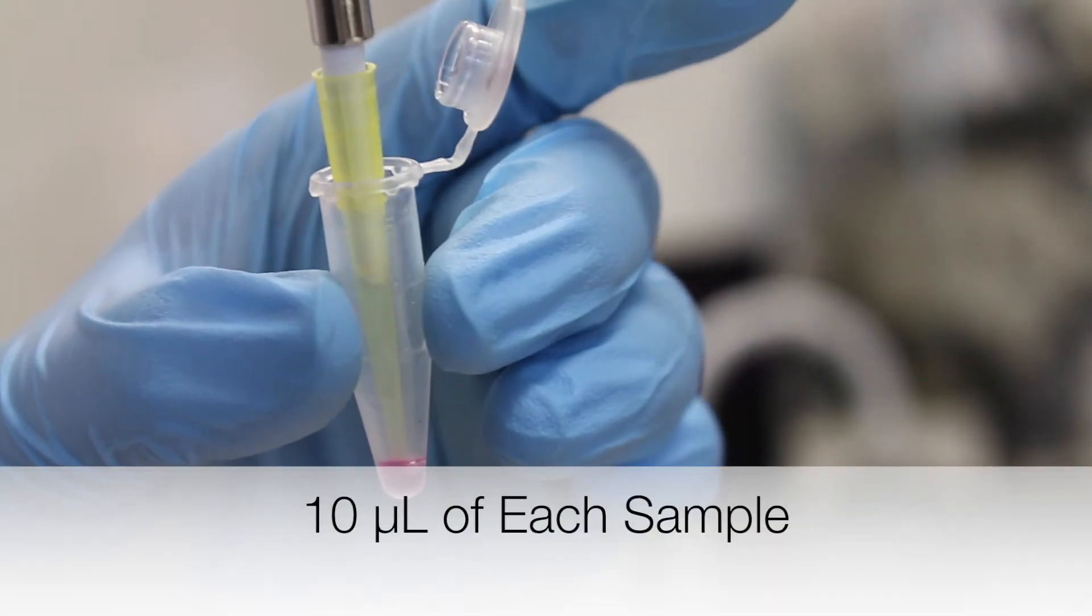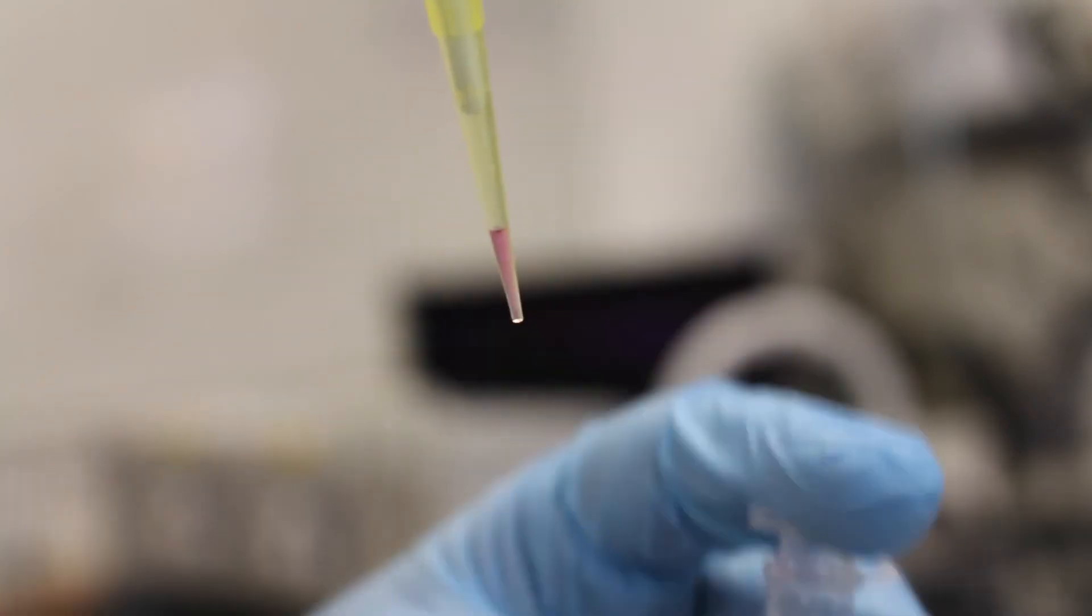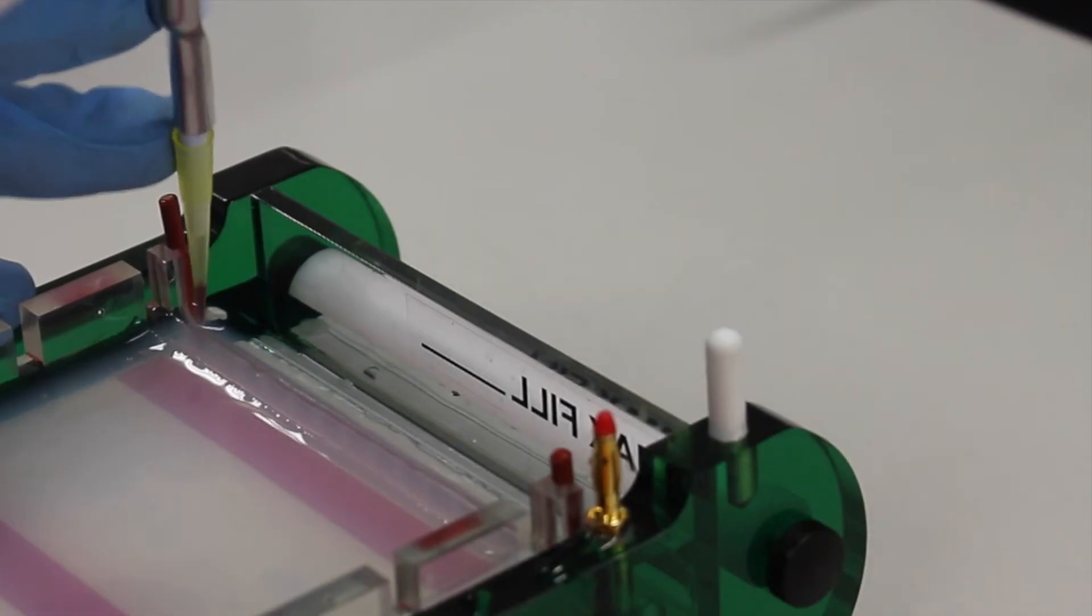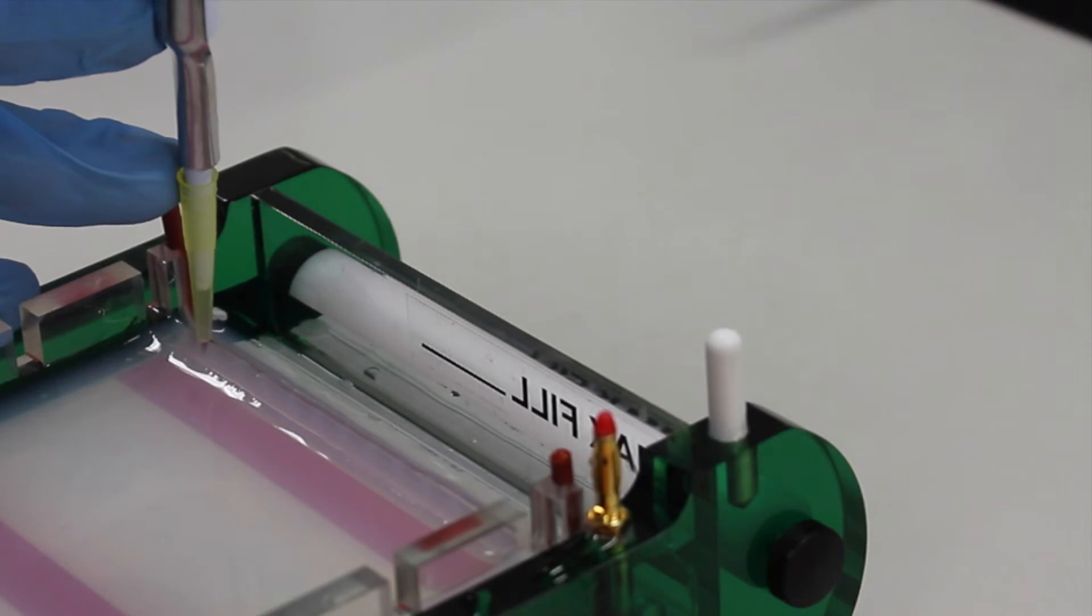10 microliters of each sample is loaded into separate wells of the gel. The DNA ladder is loaded into the first well. The other samples are loaded in a similar manner.